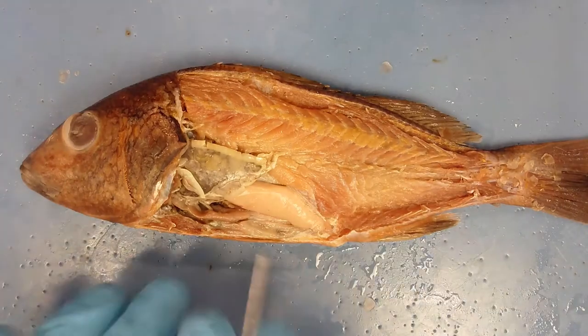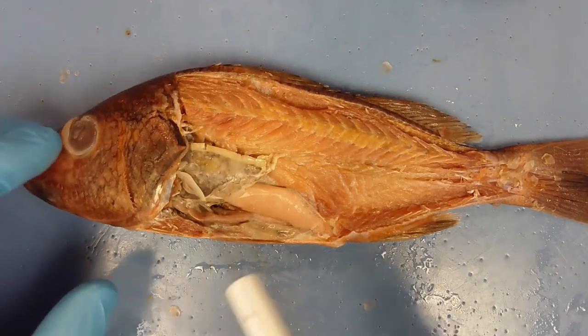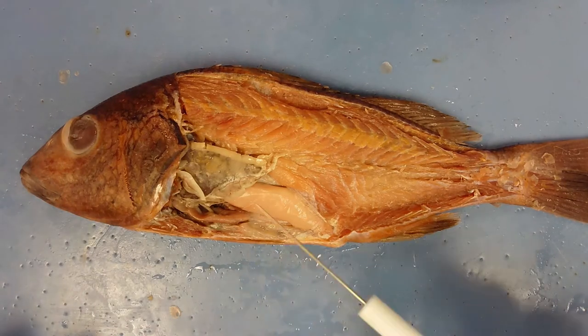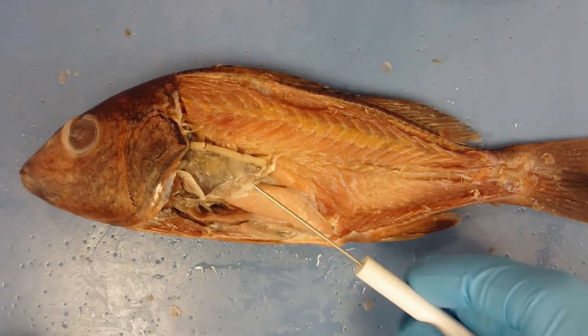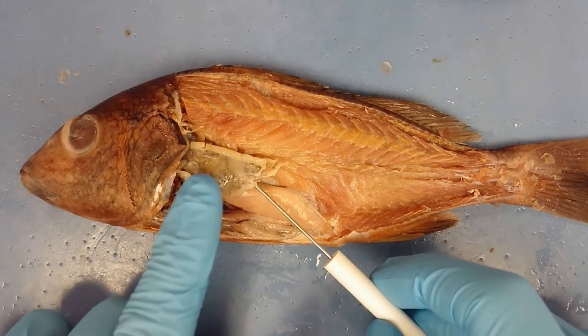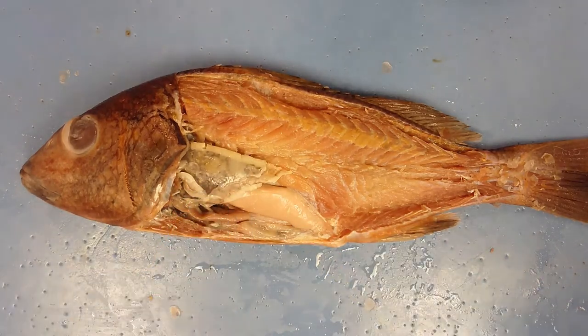Exposing the body cavity reveals a lot of internal organs. The major one visible here — shaped kind of like a leaf or triangle and dark gray — is the liver, which stores glycogen or lipids for this fish.